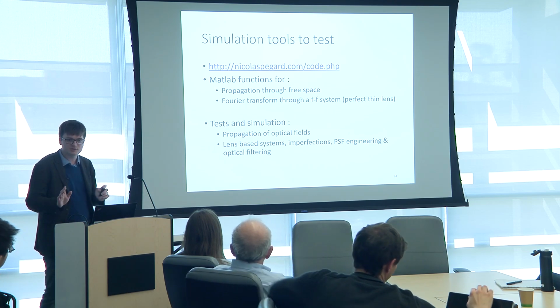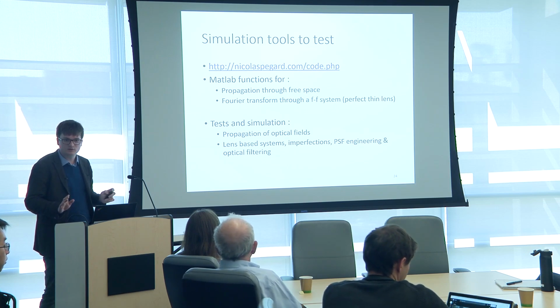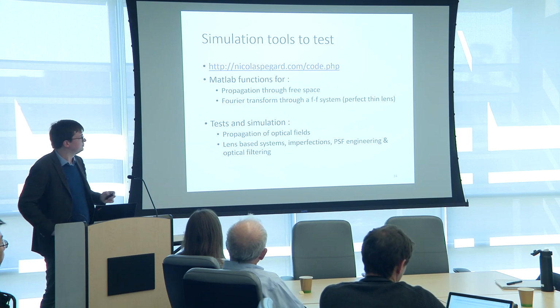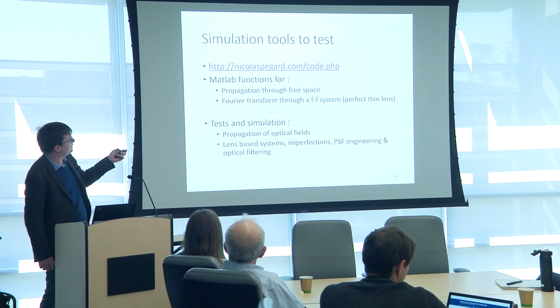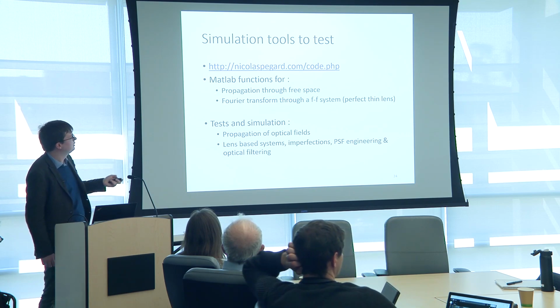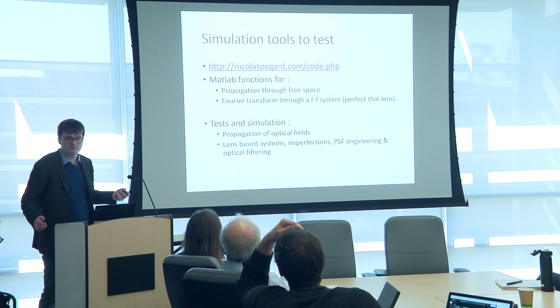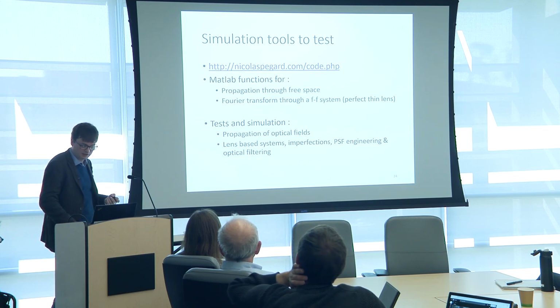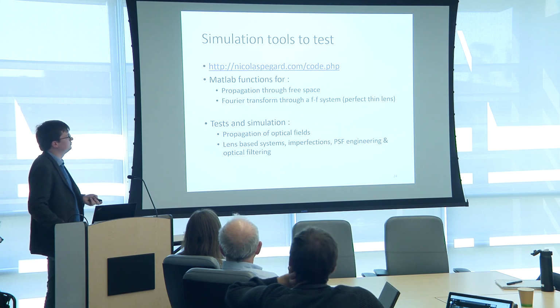I'm happy to answer any question at this point, if any of that was not really clear, before we move on to 3D SHOT. Are there any questions? All right, so all the code has been heavily commented as I was preparing for these talks, so about an hour and a half ago. And all the MATLAB functions are commented. If you have any trouble with them, please send me any feedback, and I'll gladly update the code to make it even easier to read.